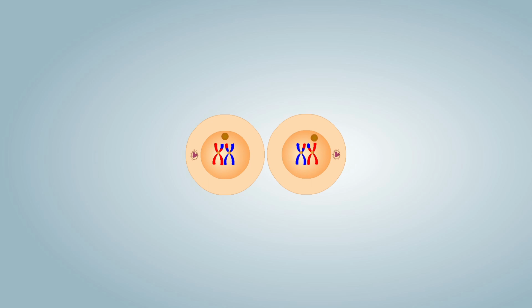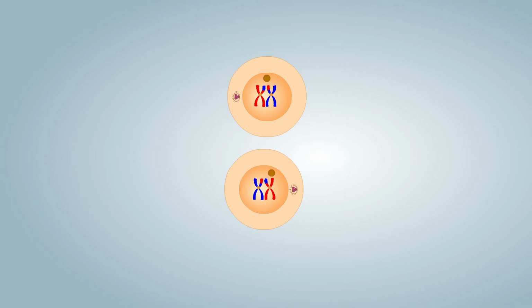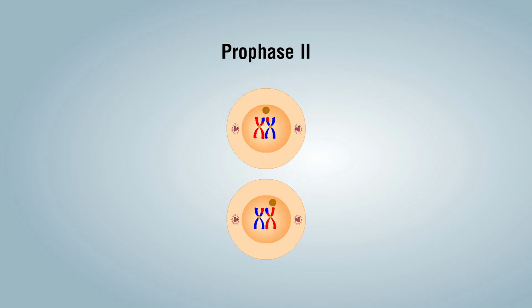Meiosis II may begin with interkinesis or Interphase II. Unlike Interphase I, no S phase occurs in Interphase II as DNA replication has already taken place. Thus, only a G phase occurs. Meiosis II is also referred to as equational division as the cells begin and end as haploid cells. Meiosis II consists of 4 phases similar to Meiosis I but with some differences.